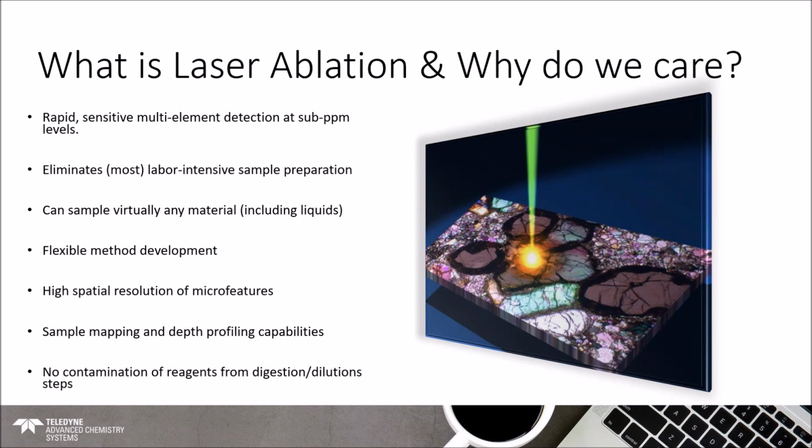First of all, it's very fast, or can be very fast in comparison, especially if you consider some of the ways that this technique started. It has its origins in geochemistry, where people were using perchloric acid or HF, dangerous acids that you'd prefer not to have around in a lot of cases. You'd have to go through that dissolution step, which can be time consuming. You also end up with waste and the expense of the acids. So this can be very quick. It can reduce that cost and the labor intensive sample prep.